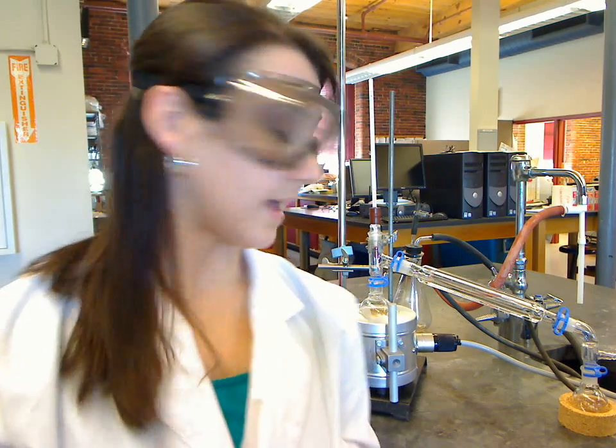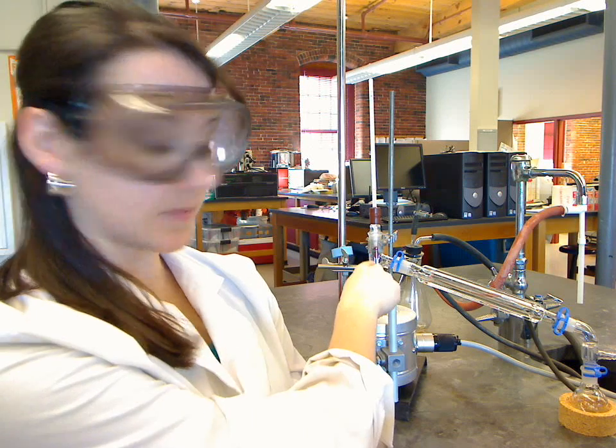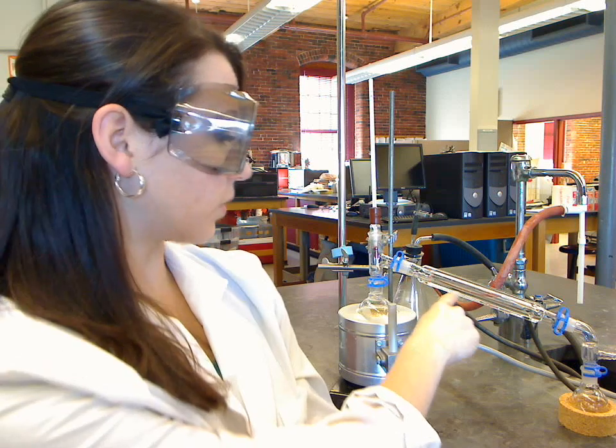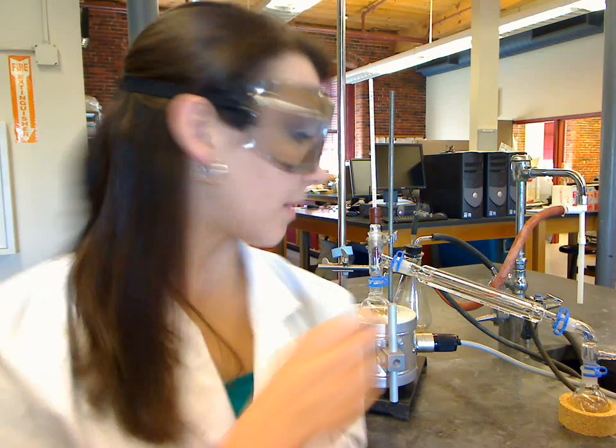The distillation apparatus seen here has a round bottom flask containing about 50 milliliters of contaminated solution. The distillation head will pass the isopropyl vapors to the condenser here, and as the vapors cool, they'll condense and trickle down as a liquid into the receiving flask. Theoretically, this solution should only consist of isopropyl alcohol, maybe a little bit of water, but we want it as pure as possible.